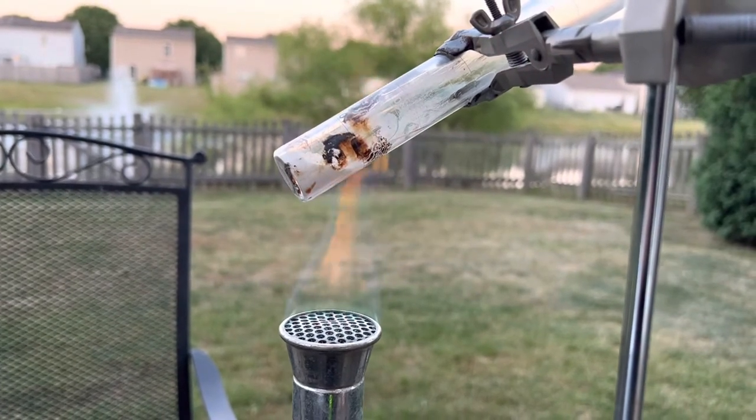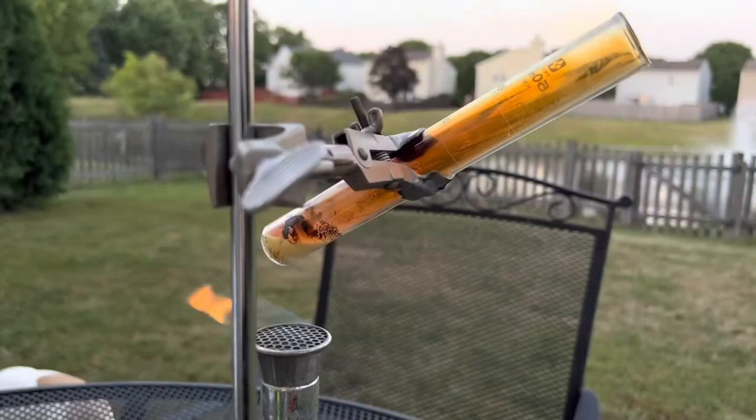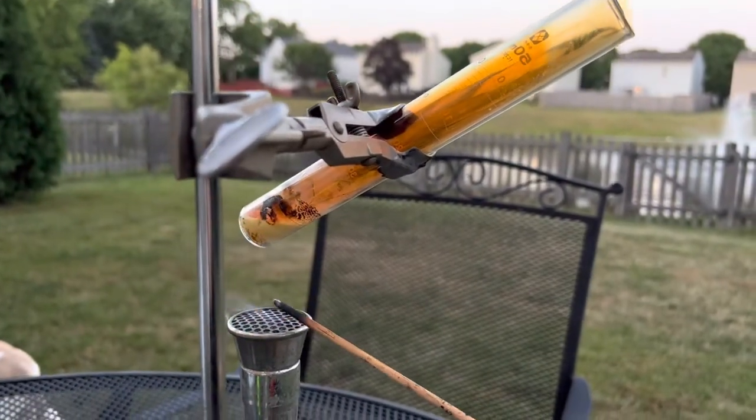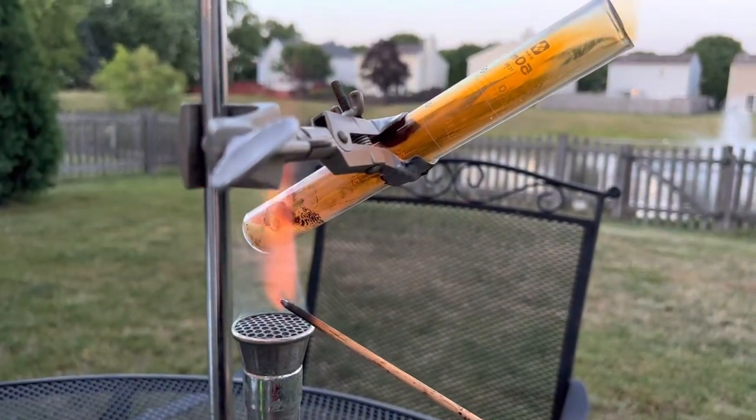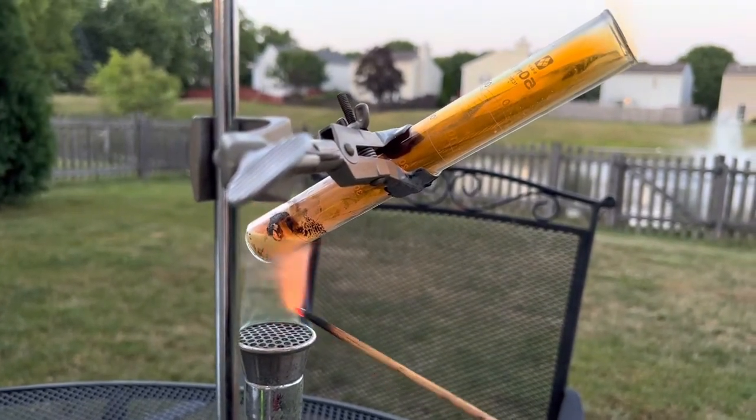And you can use a splint to detect the presence of oxygen. Let's give that a try. Let's light our splint and see if we can increase the combustion rate of our splint with the presence of oxygen.